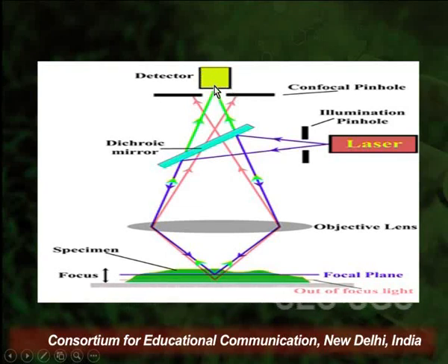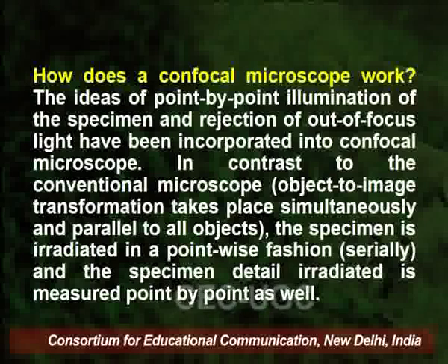These pinpoint images are created in multiple numbers with the movement of the stage, and for each movement, each point moved by the stage, there is a respective image created, and these images are superimposed frame by frame to produce a three-dimensional structure.